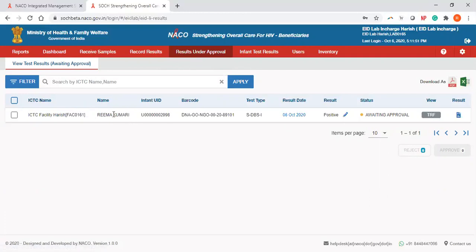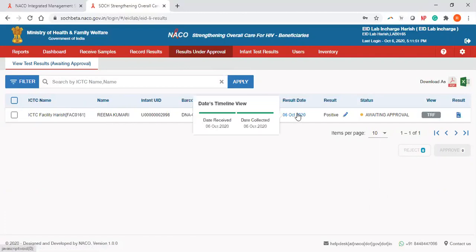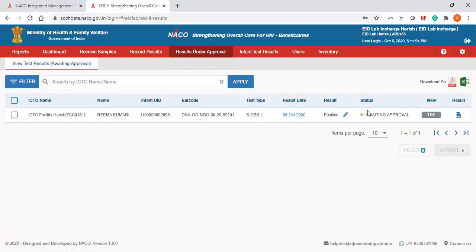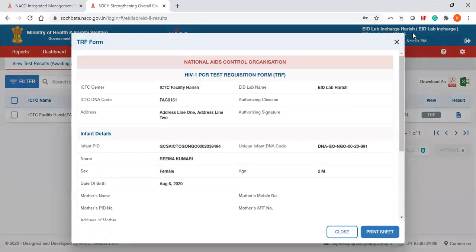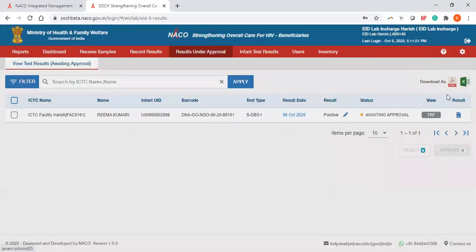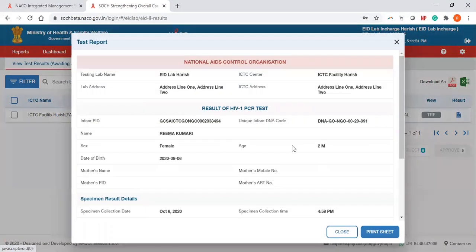The Lab in Charge can check the name of the infant, test type, result date, TRF, and the report.